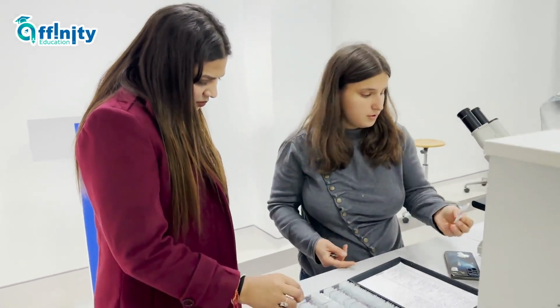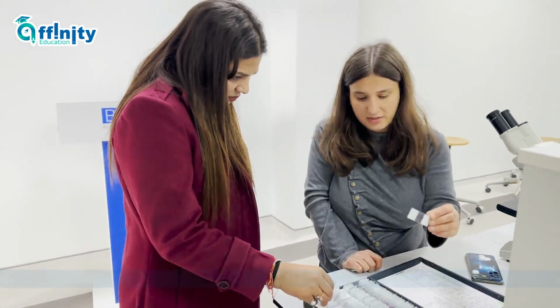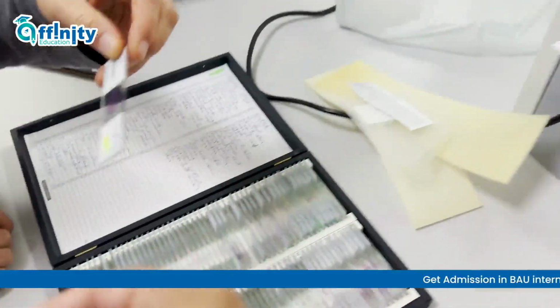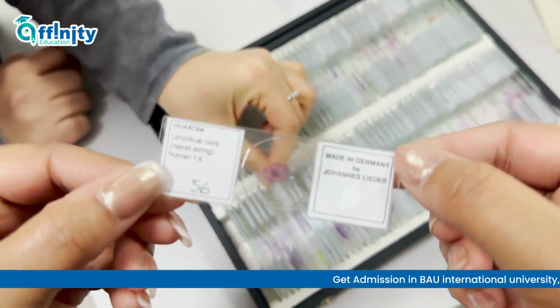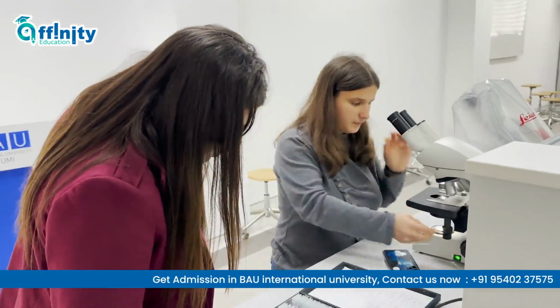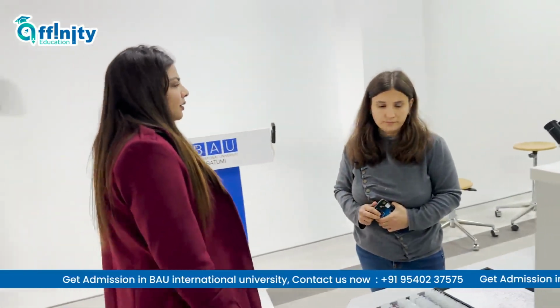So for showing students different kinds of tissues, we're showing histological tissues. Here as you see, umbilical cords, ovary. This is histology slides. Microbiology slides, we're doing them and we're dropping them because they are microbes. We should not. Okay.